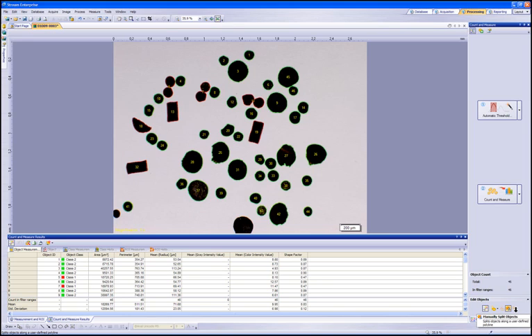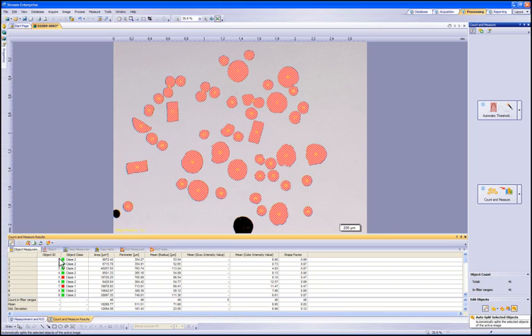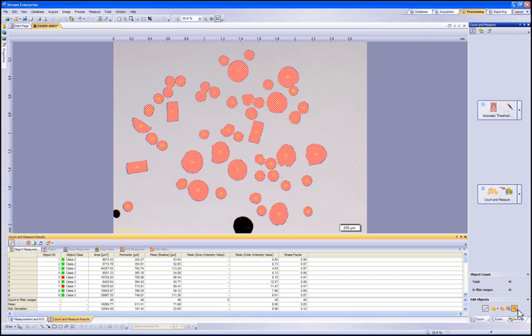The particle has now been split into two separate particles and the object measurement list was updated. We can now deal with the other particles that are touching and have been counted as one particle in a batch sequence. First select all the particles by clicking on the Object ID tab within the Count and Measure result window. That will highlight all particles detected.